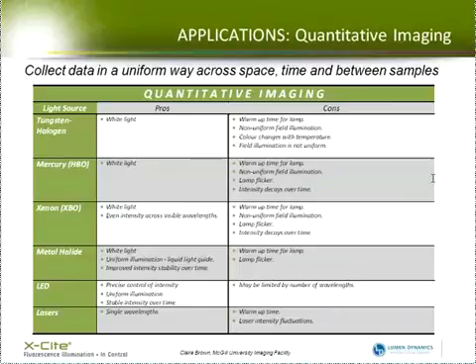So I'm just going to go now to some application-specific comparisons of the different technologies. And I don't think I'll have time to go into a lot of detail into each of these tables, but you'll have the information, and we could discuss a bit in question time as well. So what I'm going to do is just tell you which I think is the best choice for each technology, and then I'll maybe just mention a couple of things about the other light sources.